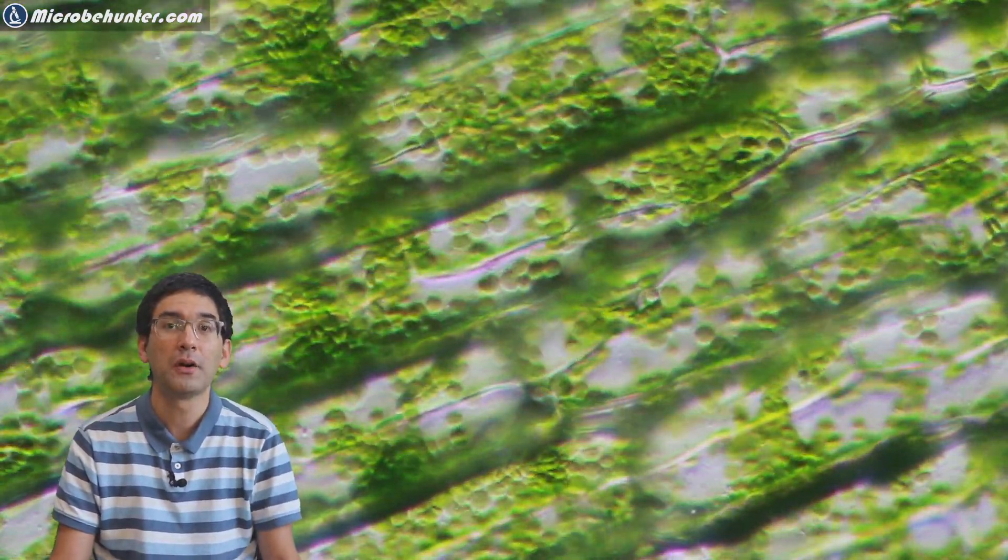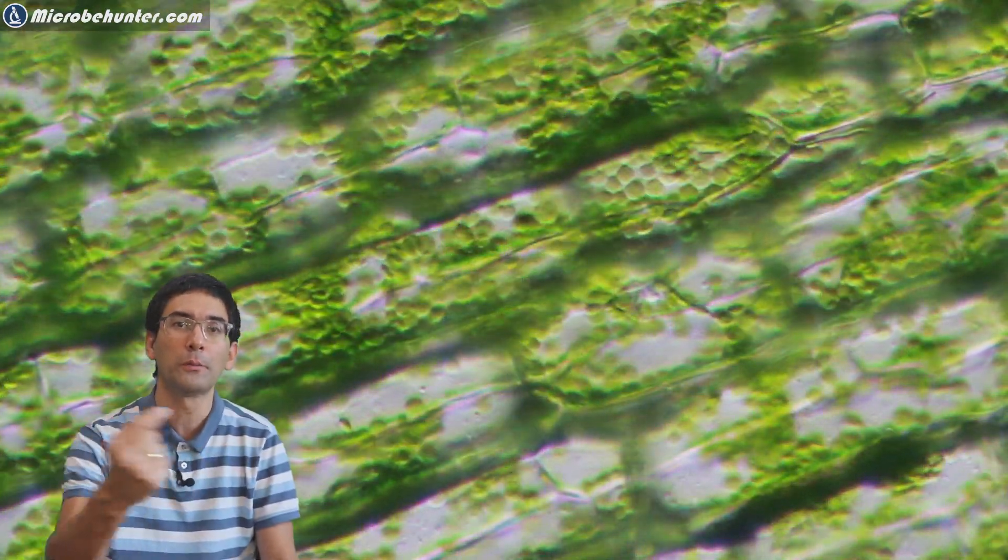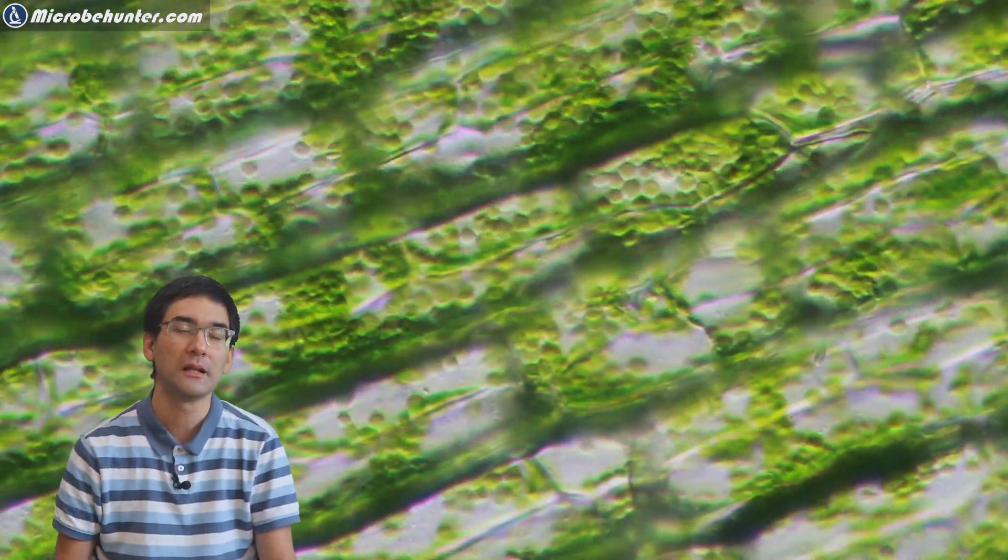Of course, many of the things that I'm showing you are in time lapse. You are able to observe the movement if you're very patient also in real time. But as a matter of fact, in time lapse, you can actually see that there is quite often a circular movement of the chloroplasts around in a cell.